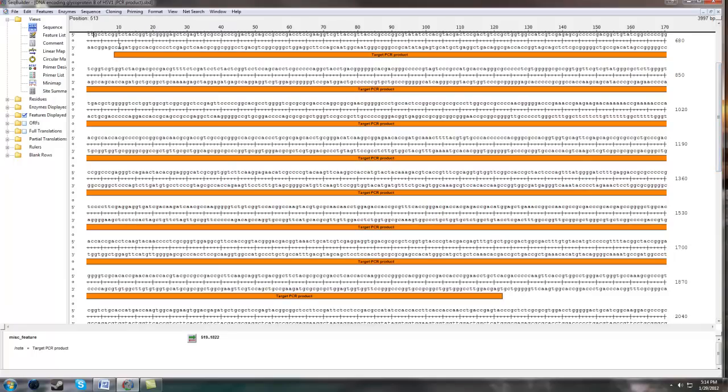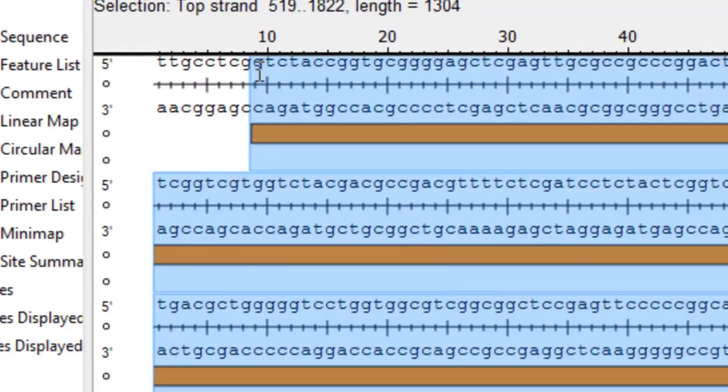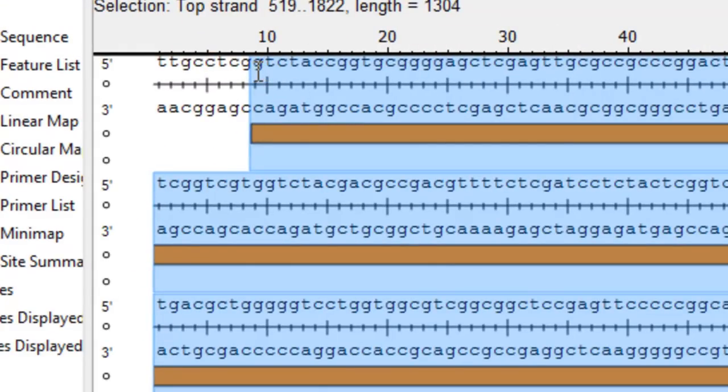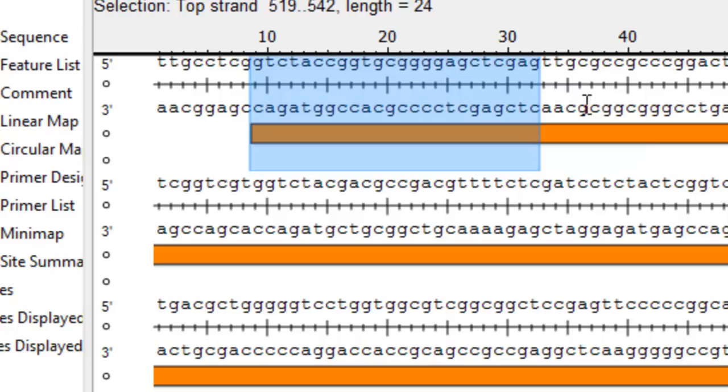First of all we want to design the forward primer first. It doesn't really matter which one you do first but mostly people start with the forward ones. What I like to do is using the sequence builder program which most universities have, I like to construct a primer around 24 base pairs. Minimum of 20 is what I've heard and read about that should be 20 exact base matches. But I like to go a little bit more than that so I usually like to do 24 for standard primer design.